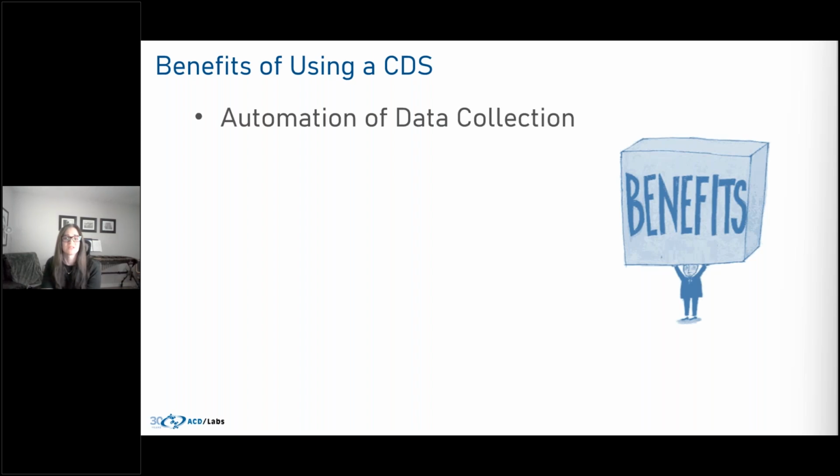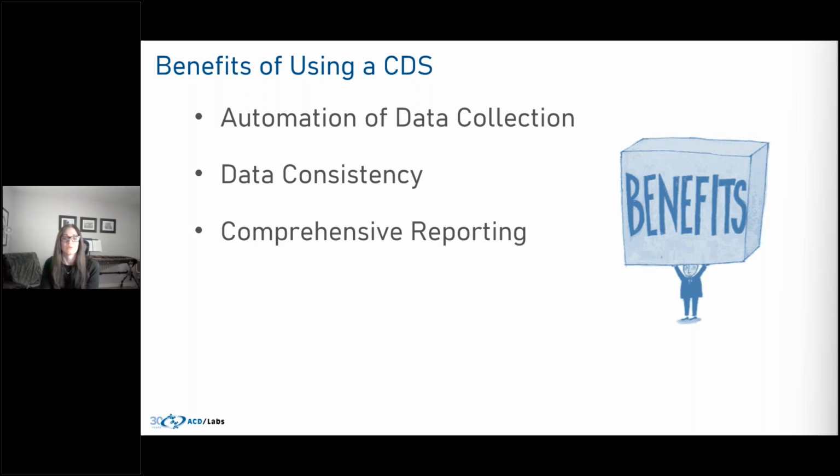Automation of data collection. By automatically collecting the data, this reduces manual intervention and human error. We have data consistency. The protocols can be standardized, which enhances the reproducibility and comparison between results. We also have the reporting capabilities. CDS systems have several report options that can help summarize your data in a more systematic manner.